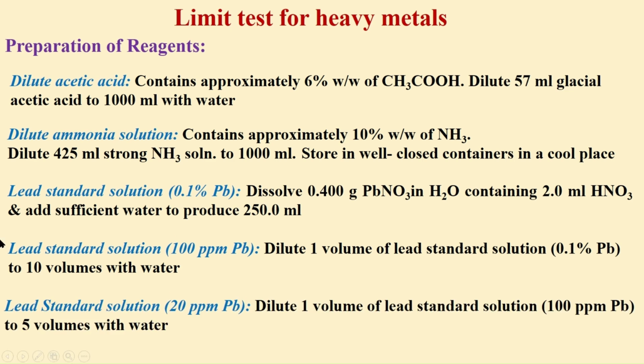The standard lead solution, 20 parts per million, is prepared by taking one volume of the 100 ppm standard lead solution and making up the volume with 5 volumes of water. We get 20 ppm lead solution.